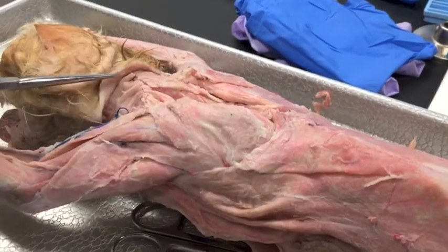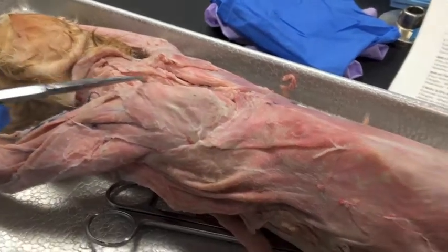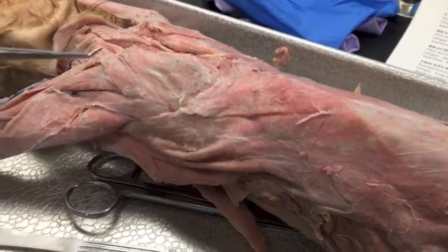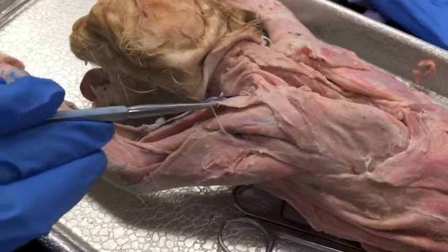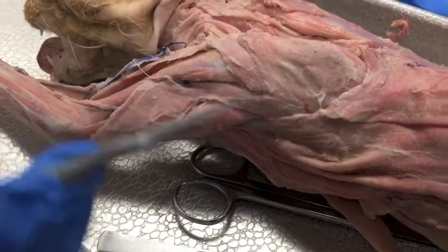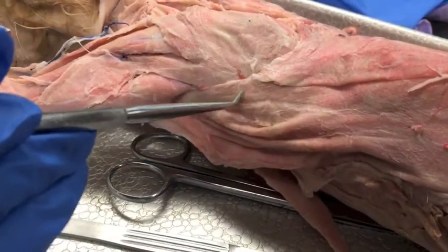Right here is the clavotrapezius, we have the acromiotrapezius, the spinal trapezius, the levator scapulae, we have the clavodeltoid, the acromio-deltoid, the spinodeltoid, and the latissimus dorsi.